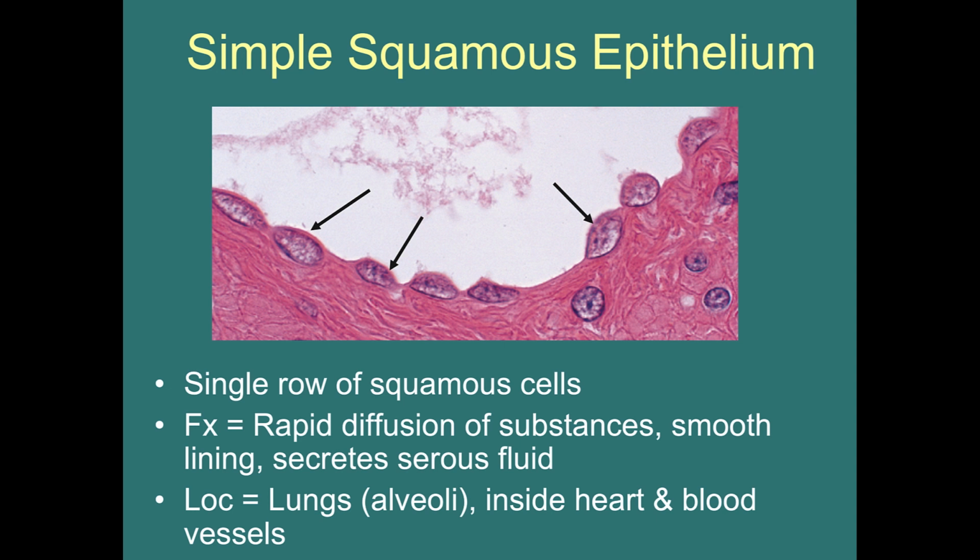So spend time looking through your microscopes. Really look at this tissue. Start on low power. Look around. What does it look like? You might look through a microscope on that slide for just a few minutes, take a photo with your phone, and then move on. You'll go home, you'll draw it, and you're like, yeah, I got this. But then you show up, and your TA has a test question set up on a different slide in a different part of that slide, and it doesn't look familiar to you at all.